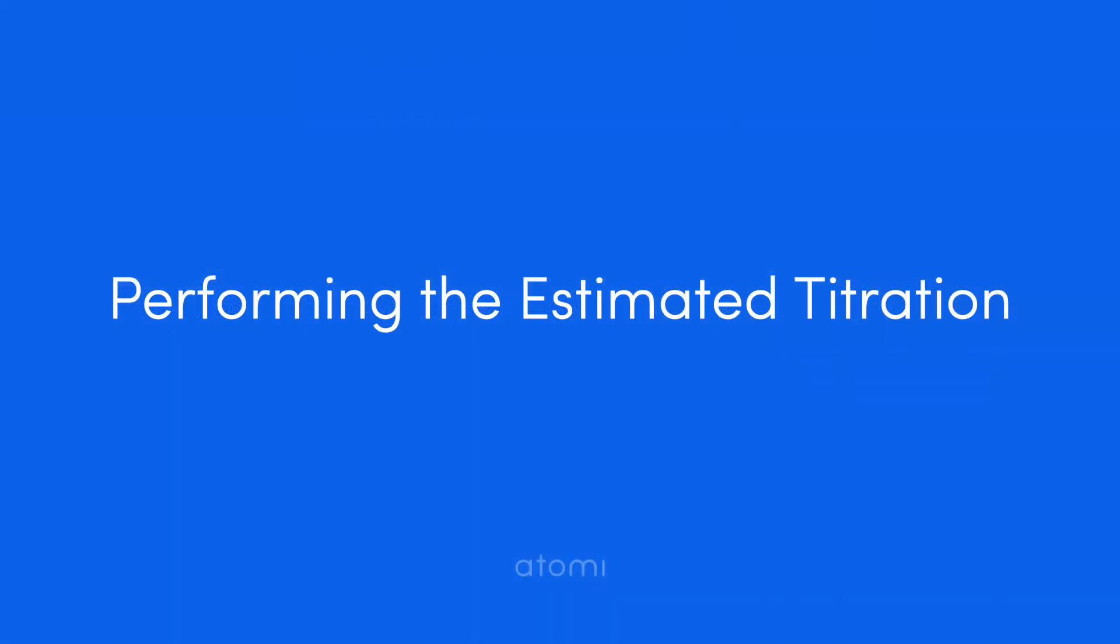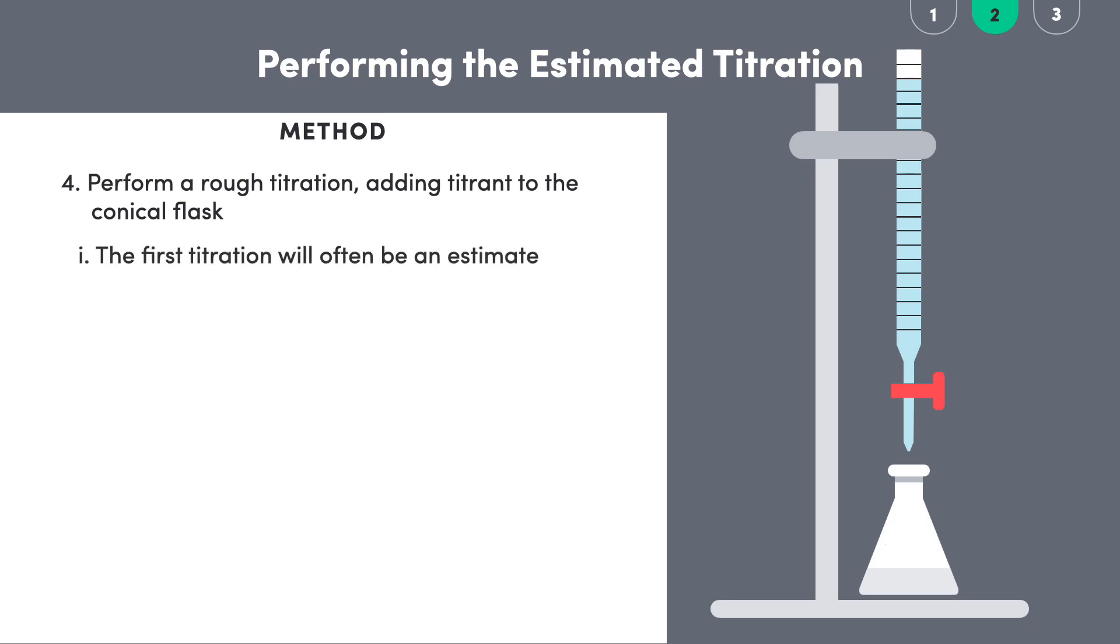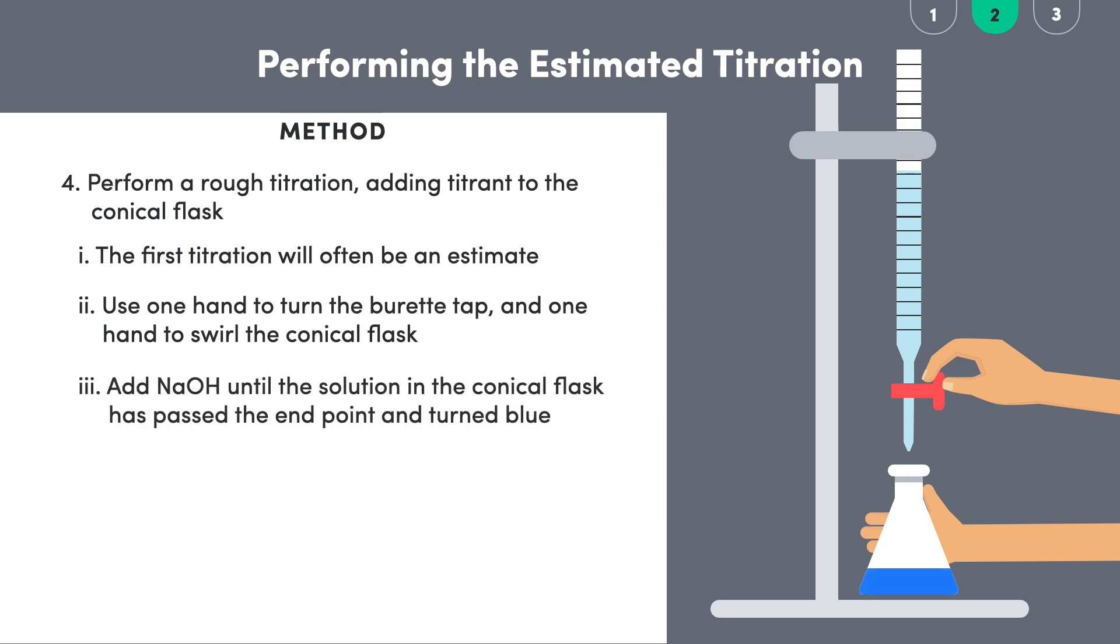Finally, we're on to our actual titration, delivering our titrant to the conical flask containing the analyte. It is common lab practice for the first titration to be an estimate, so it's also a bit of a practice run. Operating a burette requires two hands and can be a bit of a finicky process if we're not used to it. One hand turns the burette tap to release standard solution into the conical flask, whilst the other swirls the conical flask, making sure that the solutions are mixing together. As the sodium hydroxide enters the flask, flashes of blue appear in the overall slightly yellow solution as we swirl. Keep adding the sodium hydroxide until the solution inside the conical flask turns completely blue, indicating that we've passed the endpoint.